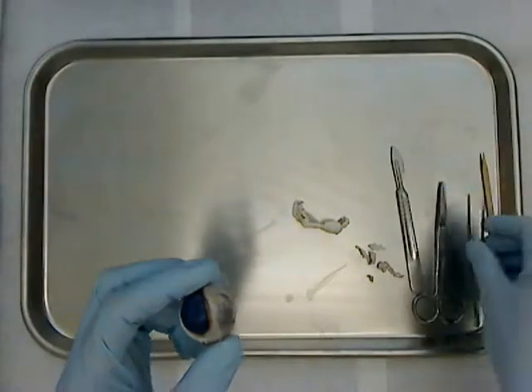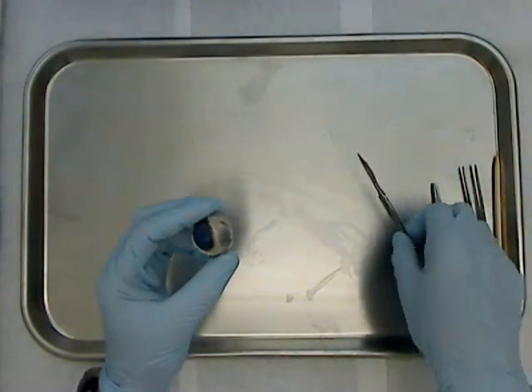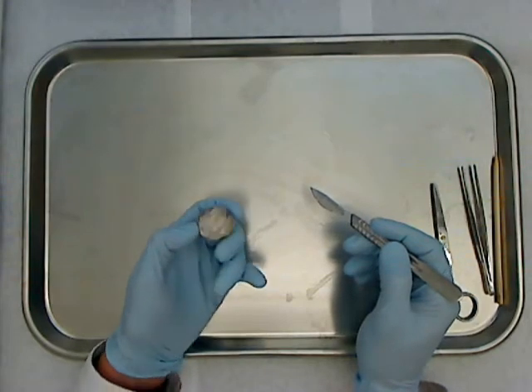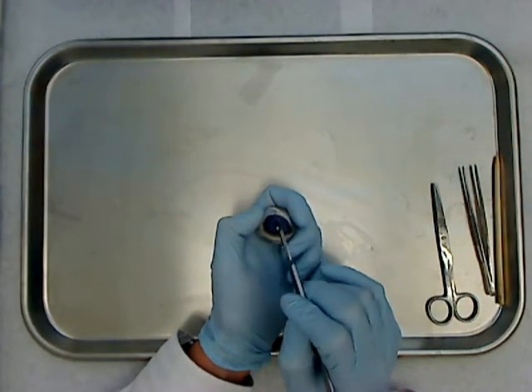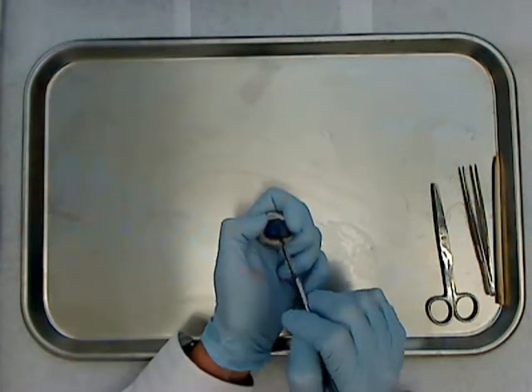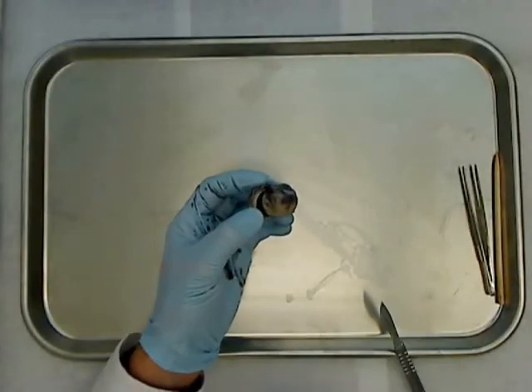Now let's do a dissection. I have two eyes here. First I'm going to do the standard transverse section of the eyeball, and for the second eye I'm going to do a frontal section. I'll start with the transverse, beginning right at the cornea with my scalpel — though it's much easier to do with scissors.